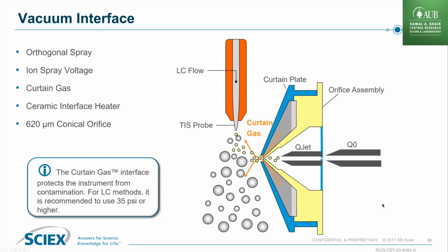So we do need to take this apart and clean it, and you also can clean the Q-jet and also the Q0. The first times you do that, I recommend you have the local service to help you and to watch and to perhaps participate under the direction, and then after a couple times you will gain the confidence how to clean it yourself.